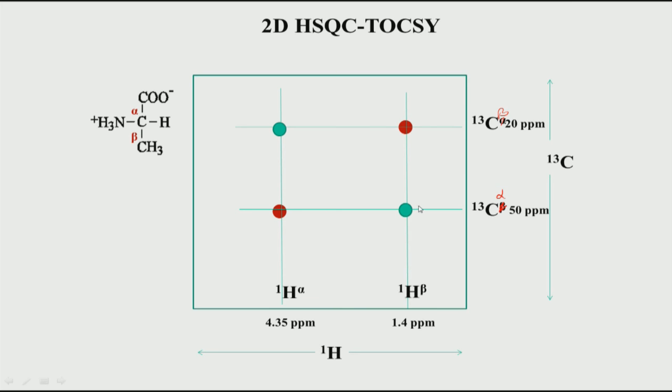Okay. So, this is how the HSQC-TOCSY works, that given a molecule or a spin system, you take any carbon in the spin system and take the line along that horizontal, and you will see all the proton peaks in that spin system will show up here. We will see examples just in a few slides. Similarly, you take any other carbon, you will again get the same full spin system along that. So, it means all the carbons will show to all the protons. Okay. So, you see this is a combination of proton TOCSY to carbon HSQC.